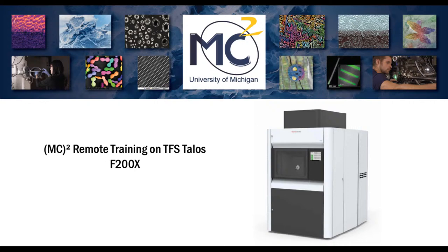Okay, hello everybody, and sorry for the wait, and welcome to this first online training on Talos. I'm going to cover the TEM alignment and the STEM alignment and all the basic operations in these two modes.